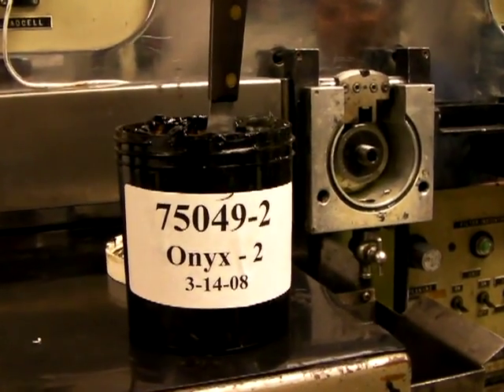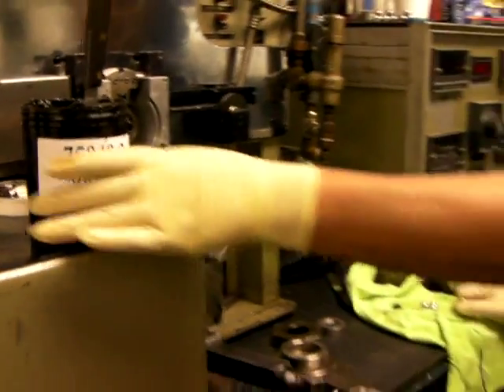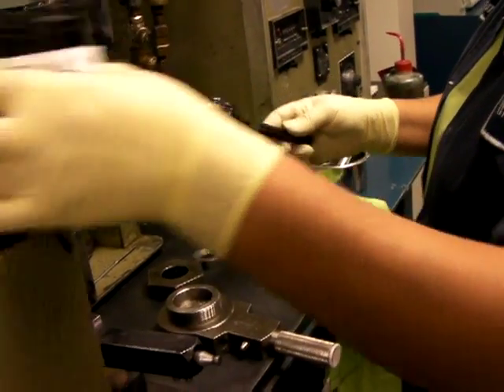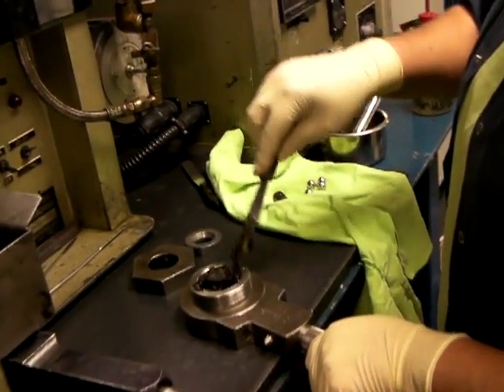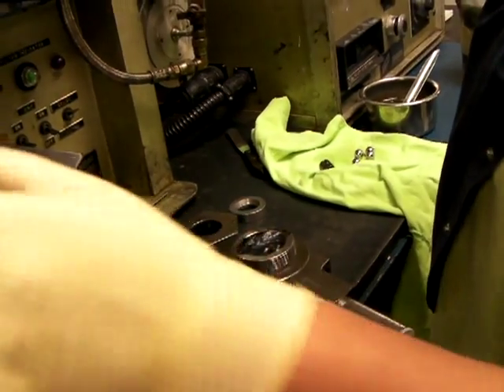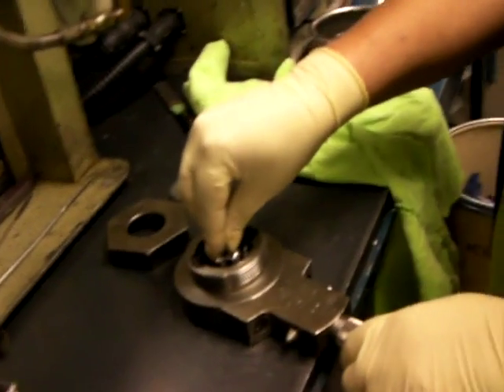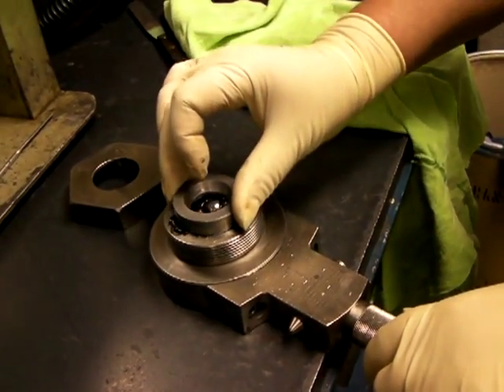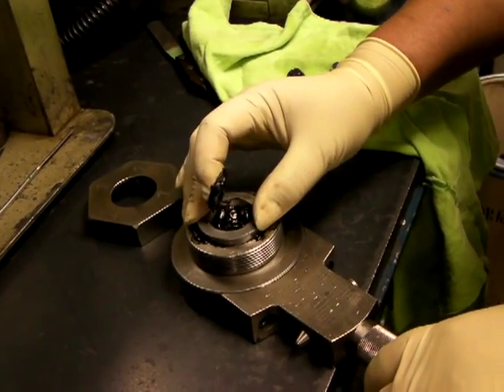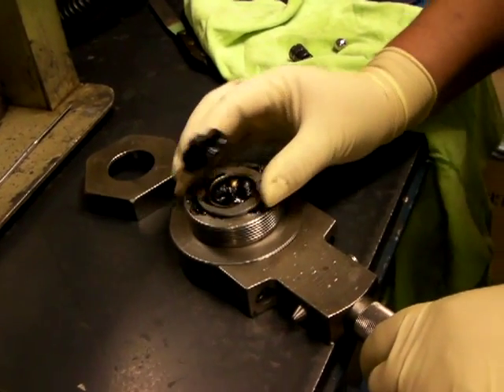We're going to make a video of the four ball weld test — the four ball EP, or extreme pressure test — on this grease. Carmen is going to do all the work. The artist at work here.